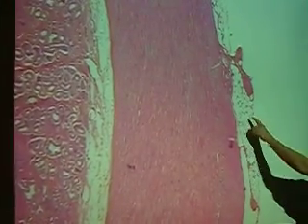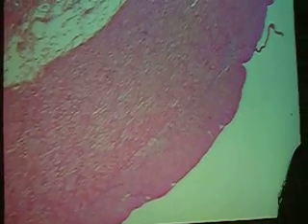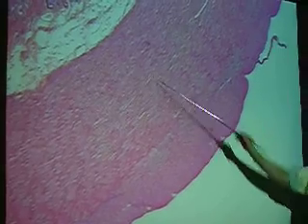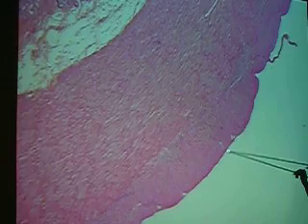Okay, then duodenum is next. We'll do the colon after that. And again, I'll slow down a little bit next time. Okay, duodenum, let's start on the outside. Let's see, right where you see the fat there. Name the outside layer. Serosa. Name this layer. Muscularis. And this has two kinds of muscle that you guys should know the difference in the direction. Inner circular smooth muscle, outer longitudinal smooth muscle. And this hardly has any serosa in most of this spot right here.